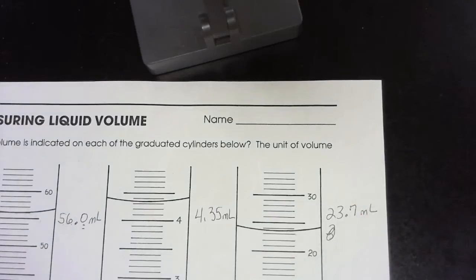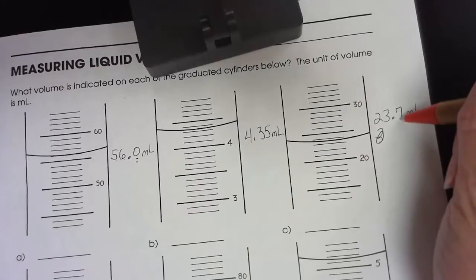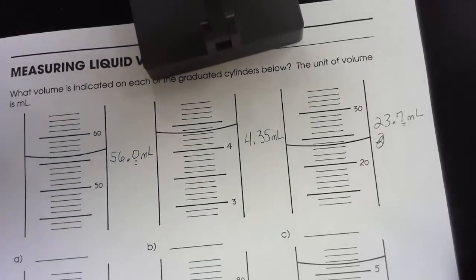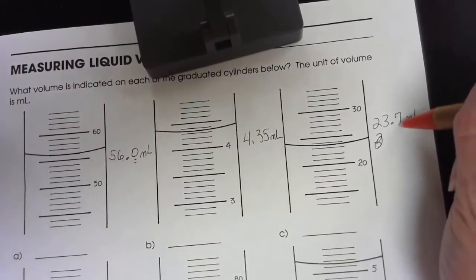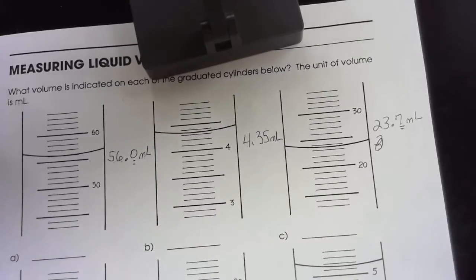Now here's where you and your lab partners may think a little bit differently. So, at this level, if you were to have said 23.5, I would take it. 23.6, 7, 8, I would take it. But we do need to include that level of uncertainty there.